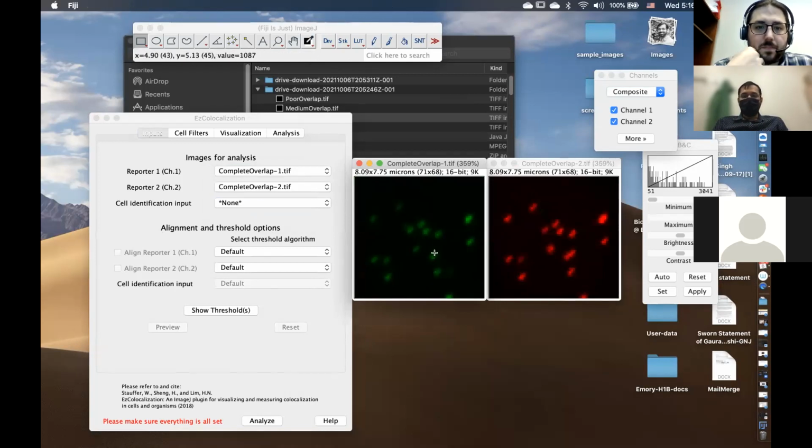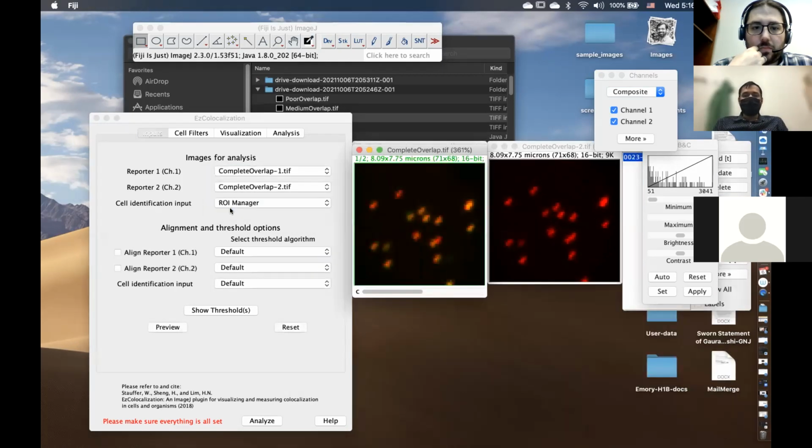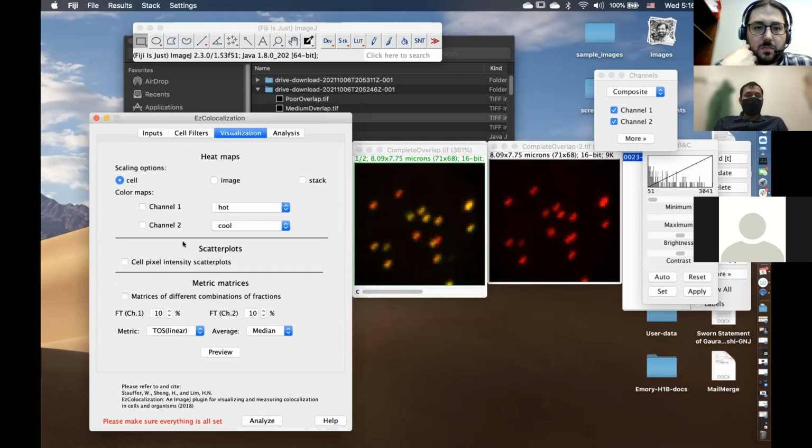Let's say, for example, I just go ahead and select an ROI over here. That's what I did, and add this ROI to my ROI manager. Now, if I was to select that, and then do analyze.